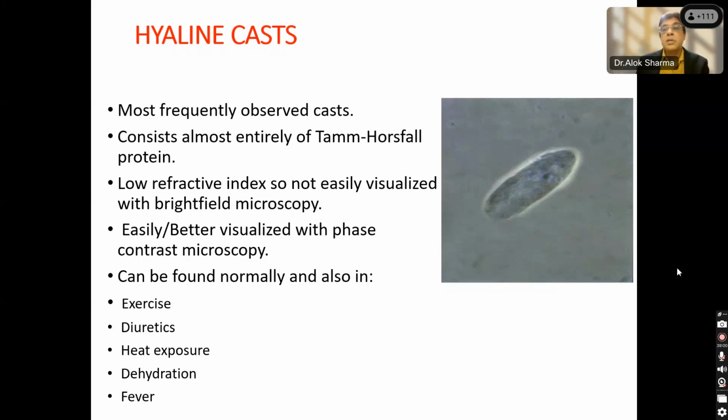That's a very good indication of the metabolic state of the patient. And in children or patients who have a urine examination during fever, you can get a large number of these. So be able to first identify the number of casts and try to decipher if there is anything abnormal in terms of clinical presentation.